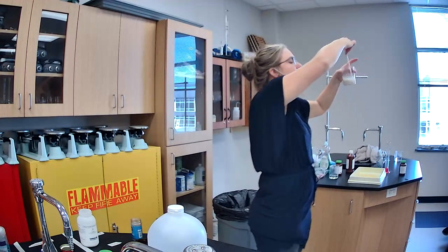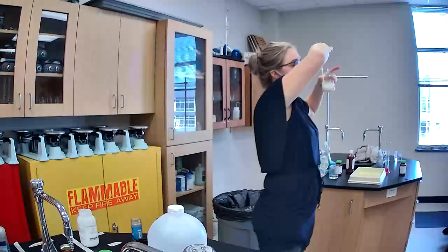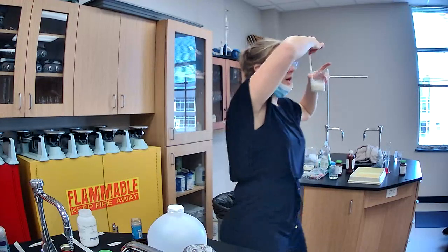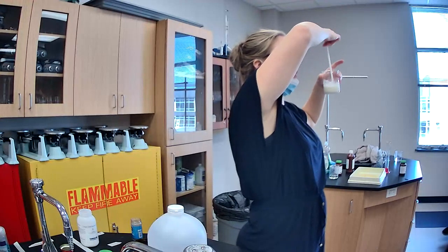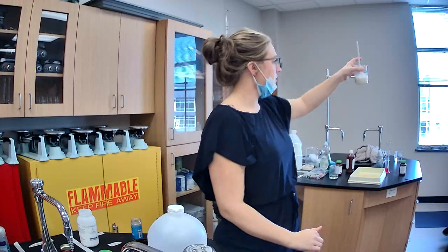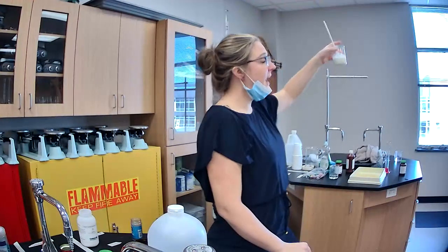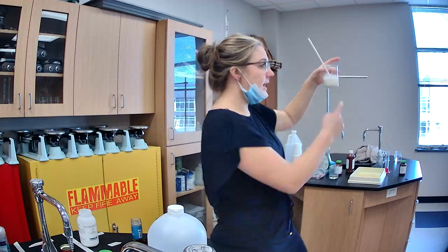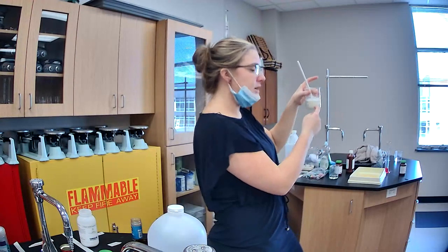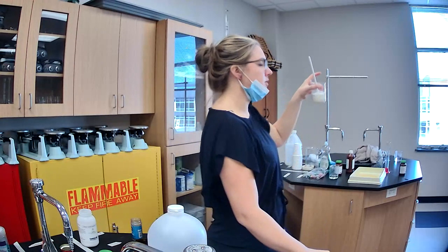Now, what is the formula for hydrogen peroxide? Anybody remember? I've told you maybe once, maybe twice. Well, water is H2O, right? Hydrogen peroxide is H2O2. The yeast with the H2O2 causes a reaction with the hydrogen peroxide, and the extra oxygen atom in the hydrogen peroxide is released, which is what you see as the bubbles.